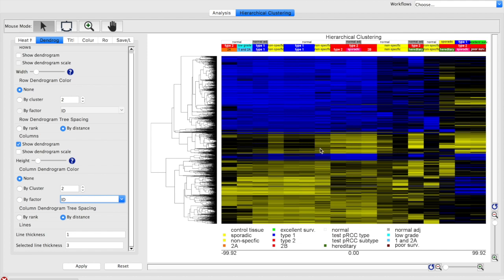I want to see what are the differences here. What are these genes that are increased in the more severe forms of this cancer? What does it have to say about that cancer? What are these genes? What are some of the biological processes that are involved in?